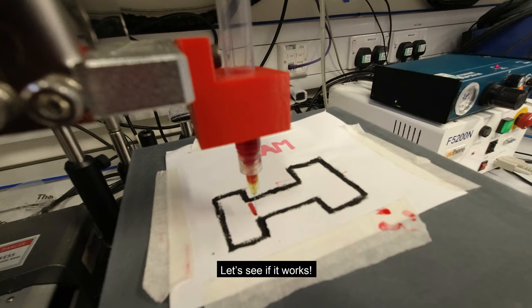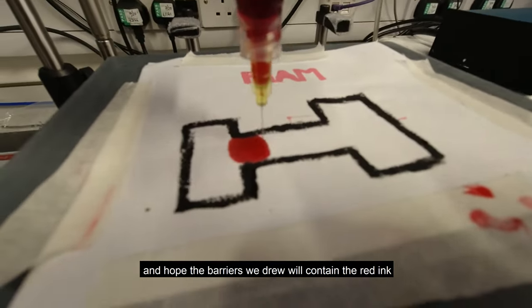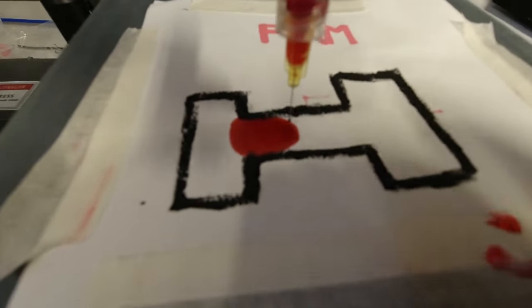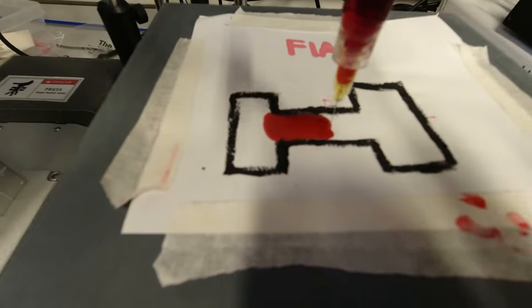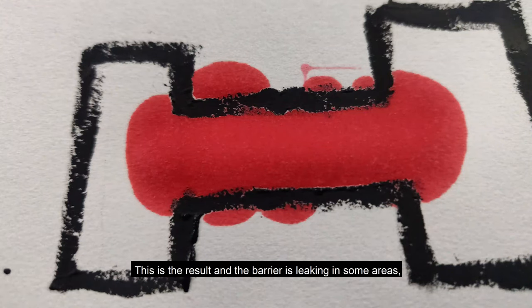Let's see if it works. We now print the center of the rectangle and hope the barriers we drew will contain the red ink. Oh no! This is the result, and the barrier is leaking in some areas, but it did work in others.